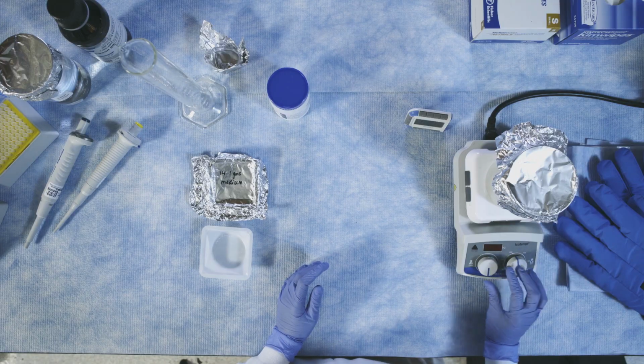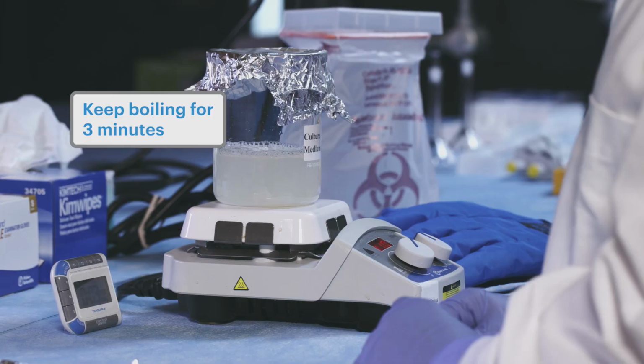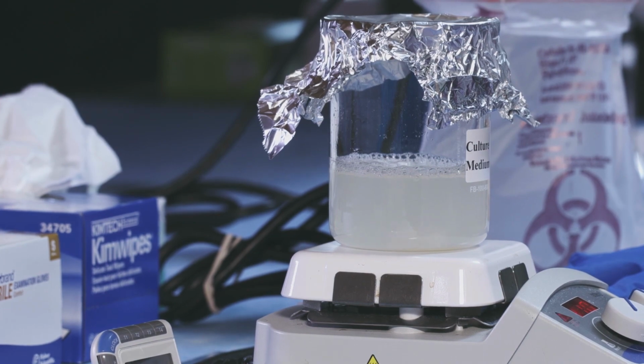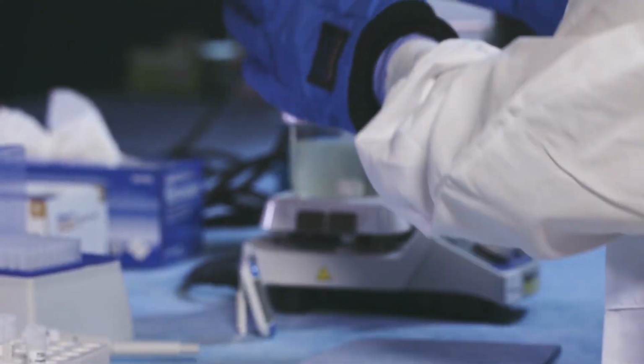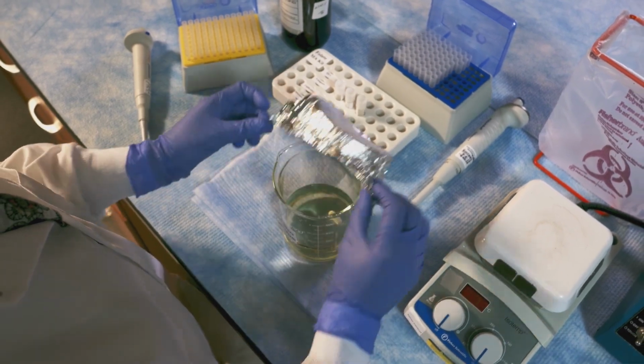Heat to boil while stirring and keep boiling for 3 minutes. Cool down to room temperature.